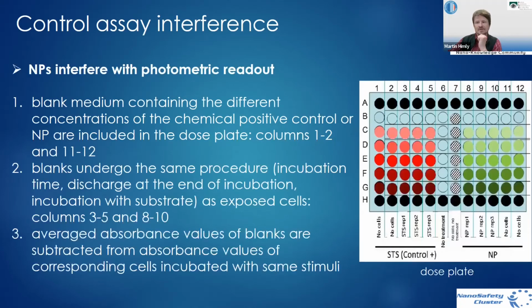Coming back to what has been mentioned, to summarize a bit, I have mentioned, for example, nanoparticle interference, and this basic information is derived from SOPs that we generated within the 7th Framework Programme in the NanoValid research project, which maybe some of you have even been involved in. At that time, it was long ago. These SOPs already took care of including interference testing with nanoparticles.